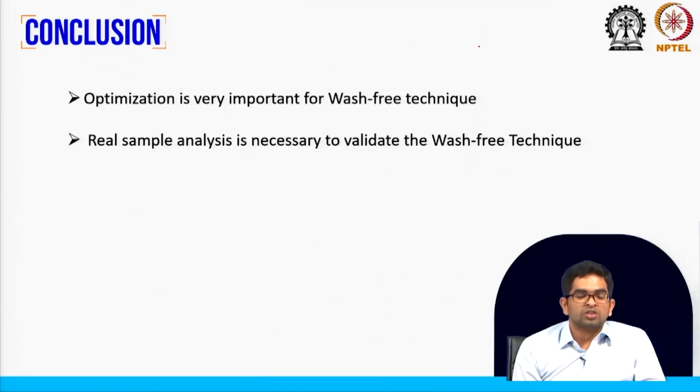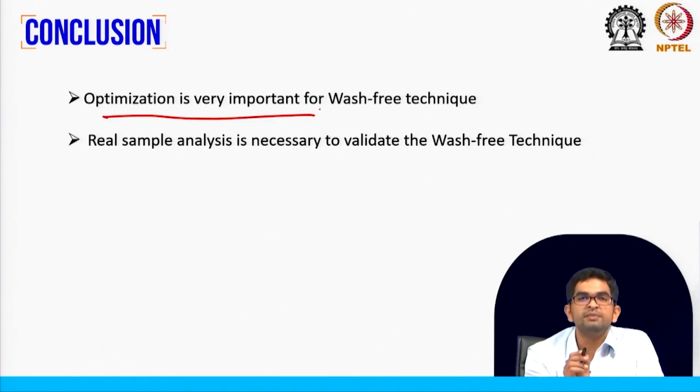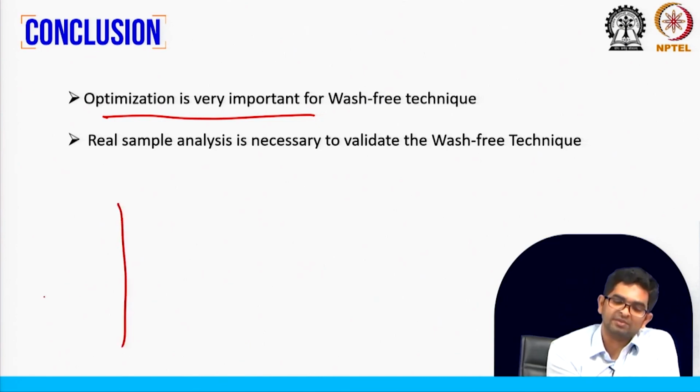Okay, so this is the main part that we learned today. In this biosensor, we can optimize all the techniques, and this optimization is very important for washing free biosensors. So first you have to run a cyclic voltammetry. Whatever chemical you are using in that washing free sensor, just run a cyclic voltammetry.